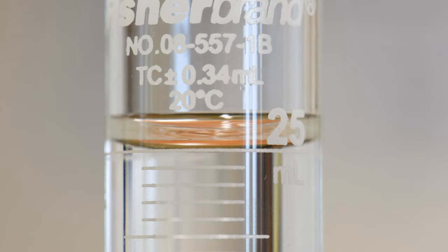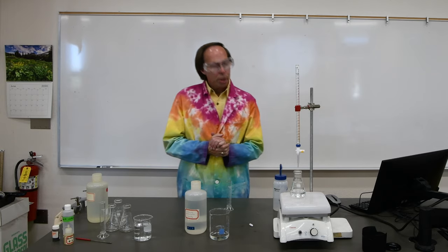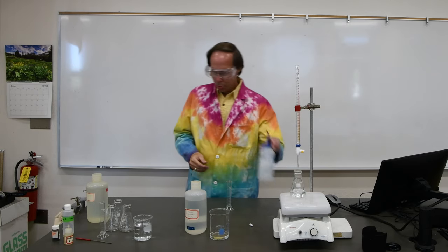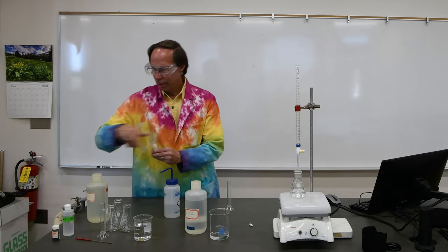This is the volume of our calcium carbonate sample for the first titration. Now we're just about ready to carry out our titration. But before we can do that, we need to add our indicator.